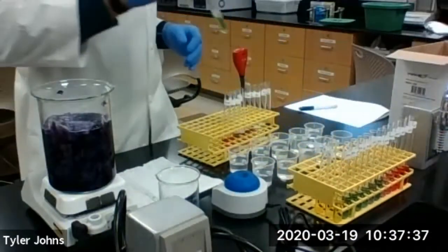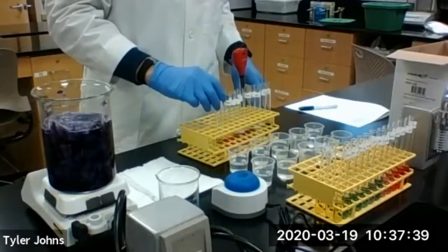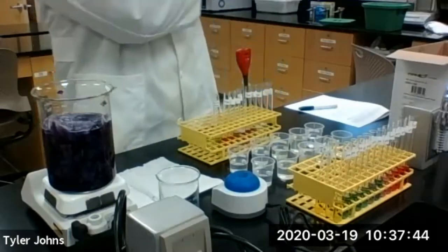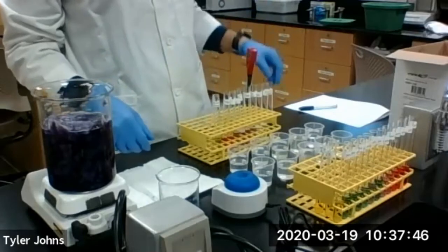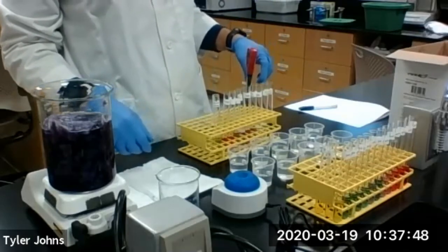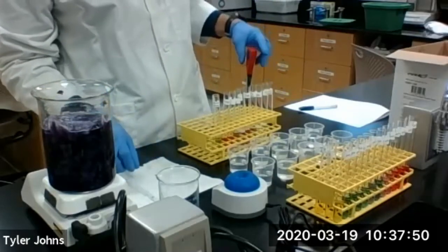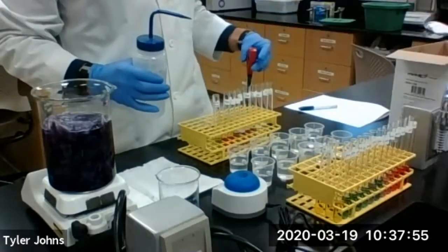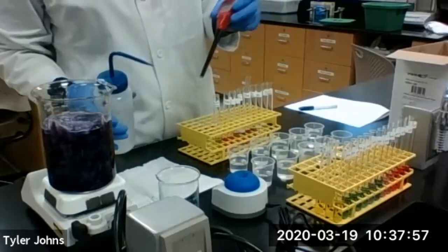Okay, now that we've checked our household solutions with the cabbage juice indicator, we're going to go ahead and use a pH meter and see what the pH value of each of these solutions is using a pH meter. Every time we move between solutions with the pH meter, we need to rinse it with deionized water.